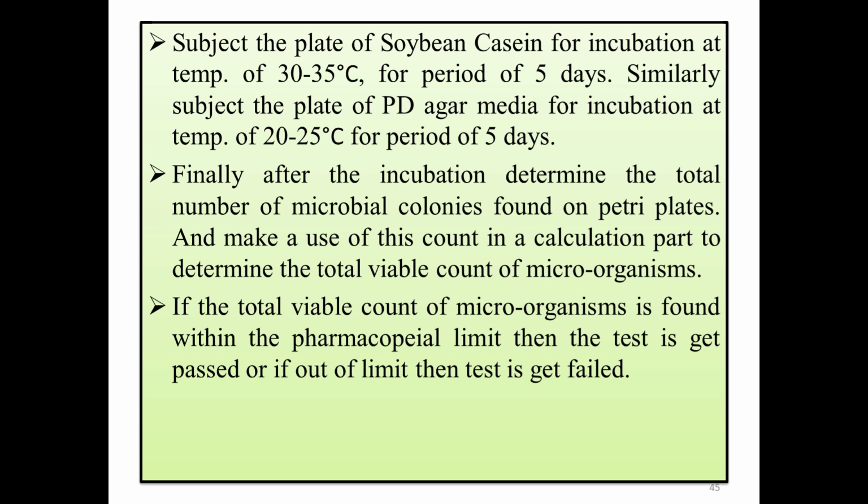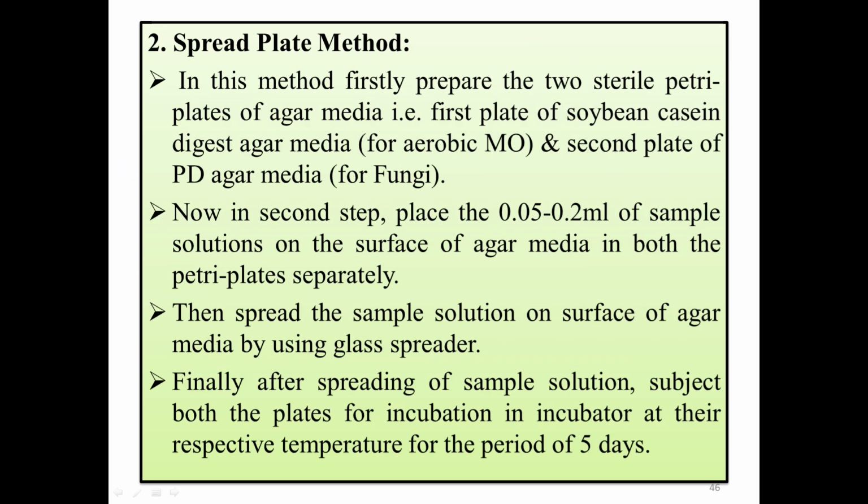So the summary of this method is, we have to prepare two samples. We have to prepare two samples.